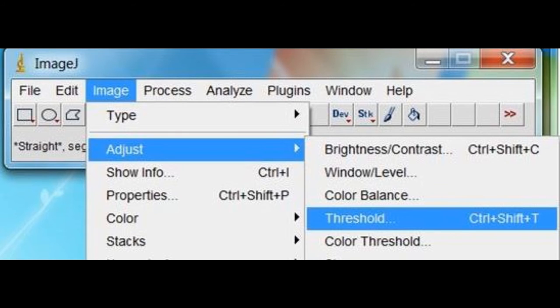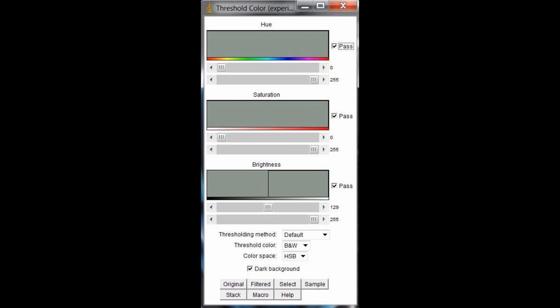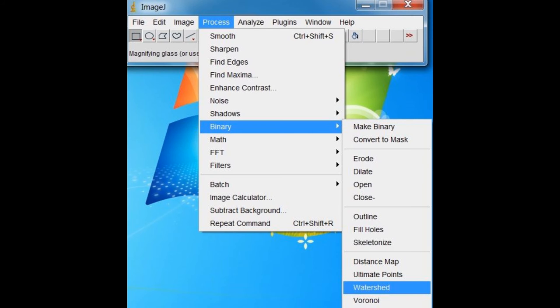At first the particles within the threshold will appear red. Adjust the brightness to include the particles you desire. When ready, click Apply. Then go to Process Binary, Make Binary to turn the image into a black and white one.